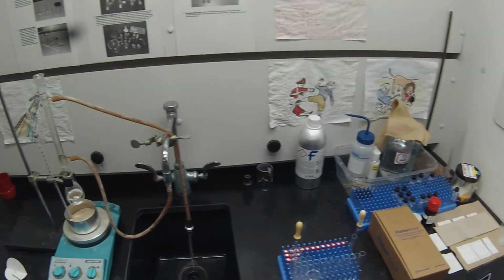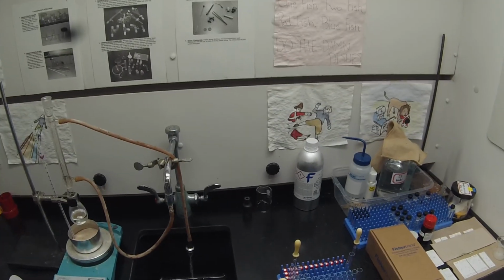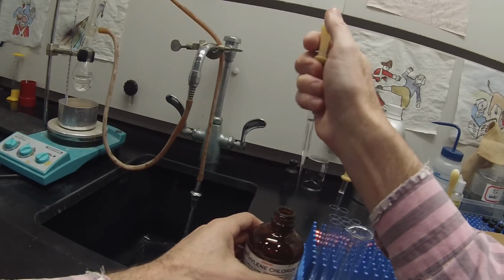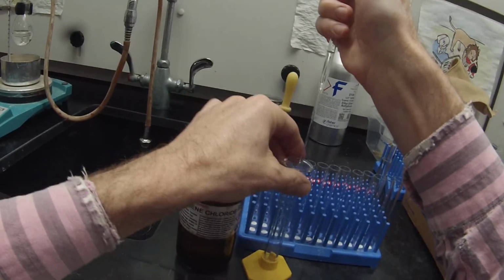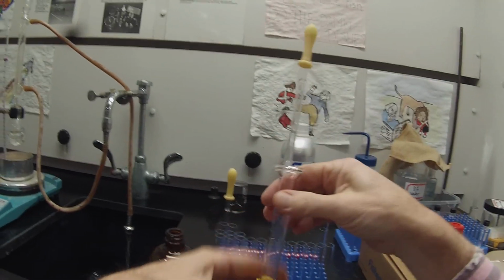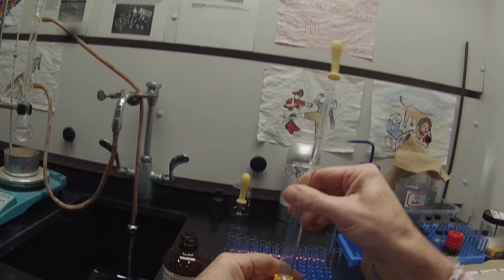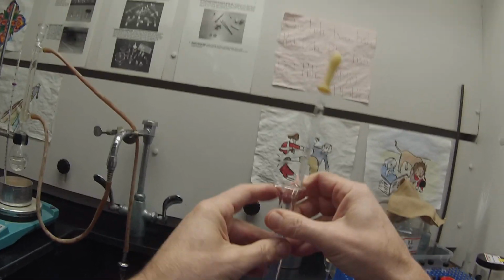So what I'd like is I'd like to know where the half milliliter level is. So I take out half a milliliter each time. So what I'm going to do is I'm going to measure half a milliliter of dichloromethane into one of these 10 milliliter graduated cylinders.